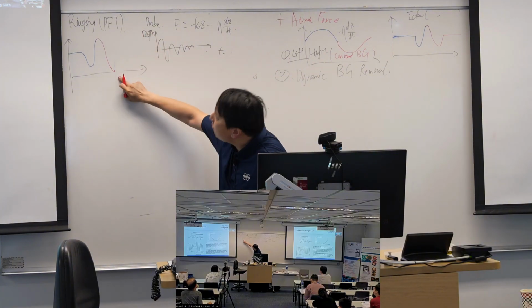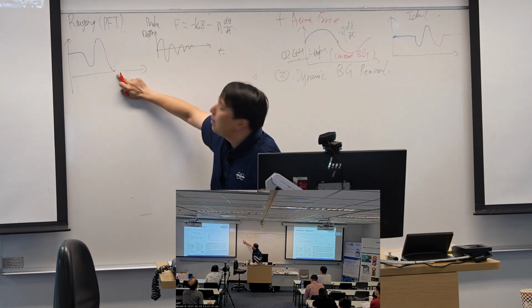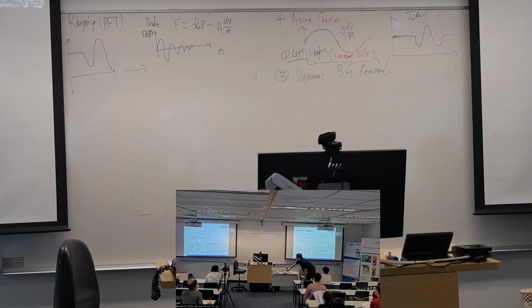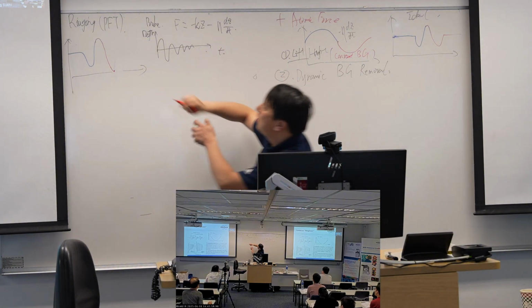And then after the adhesion force, our probe is trying to move up, and then it will get rid of the adhesion force. It will be similar to when I bend the probe to the bottom and then release it. It will start to do this kind of damped oscillation. So we may observe something like that.